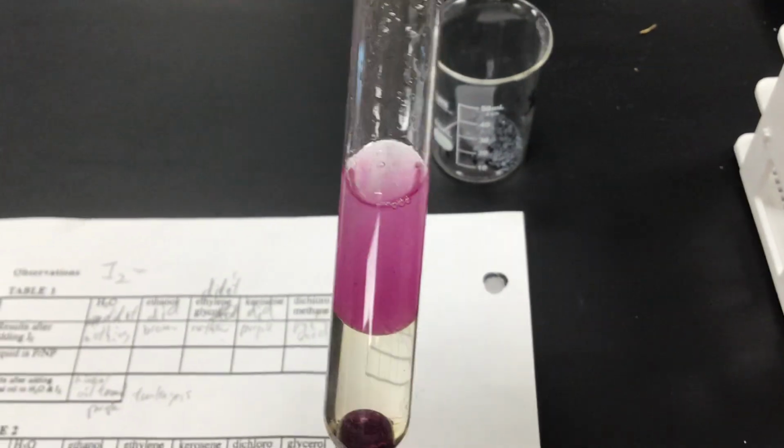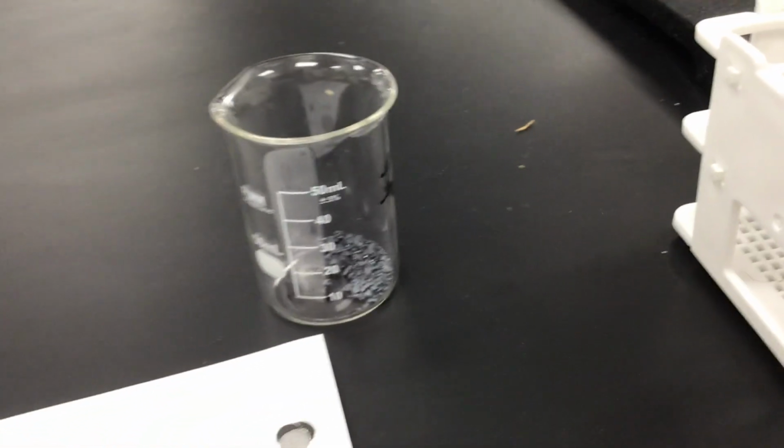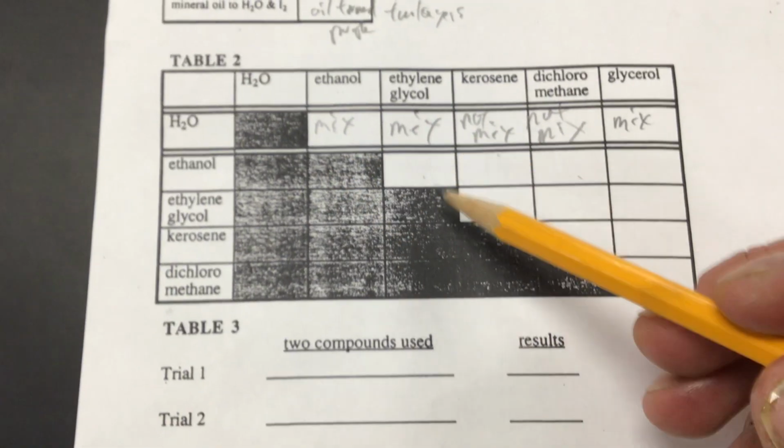So now the question is, which one's polar and which one's nonpolar? Is the water polar and the mineral oil nonpolar? Or the other way around? Then the next thing you need to do is predict what would happen if you mixed these 2 together.